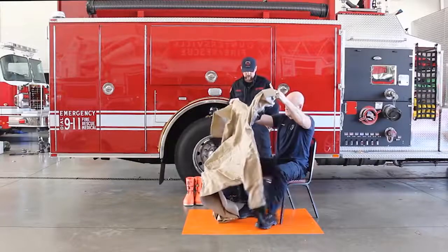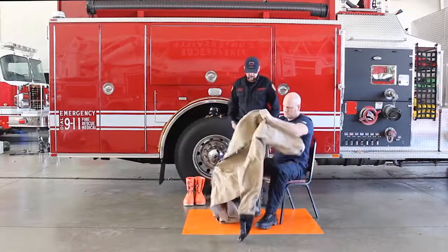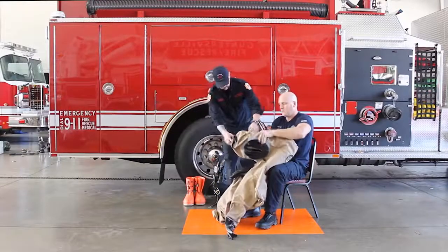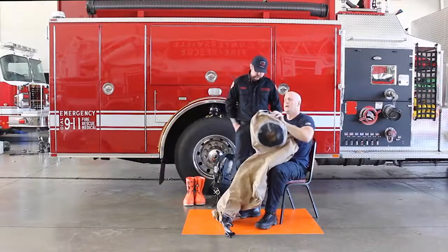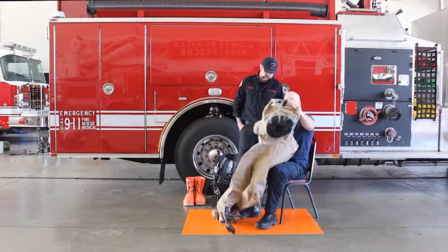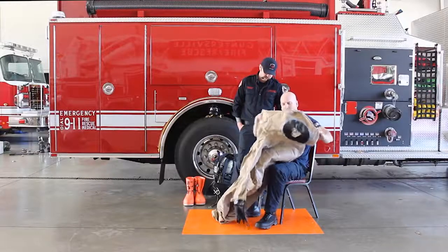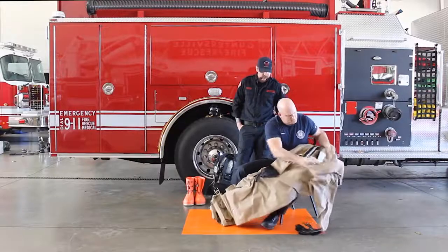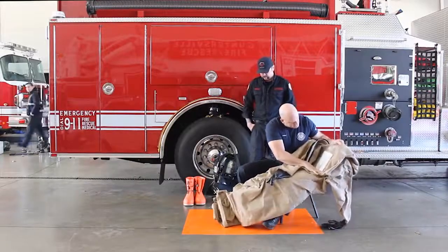Conduct a brief visual inspection of the garment before beginning donning procedure. Open the garment zipper closure completely and read the garment size label to assure proper fit.